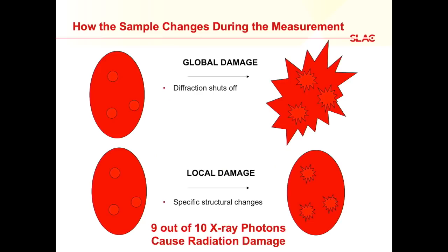To not dwell on the point too much here, but what I find amazing is all this happens, and yet we see where atoms are, as I said, a million times smaller features than these giant explosions. All of this can be done despite these incredible changes that we see in the sample long after the X-rays are gone. As I said, the X-rays pass through the sample at the speed of light. This happens more at the speed of sound. Pretty amazing to me still that this works.